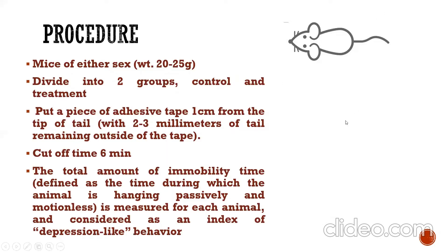After taking the mice, put an adhesive tape one centimeter from the tip of the tail, ensuring that two to three millimeters of tail remain outside the tape. The tape should be strong enough to prevent the mouse from falling and should not damage the skin of the tail.